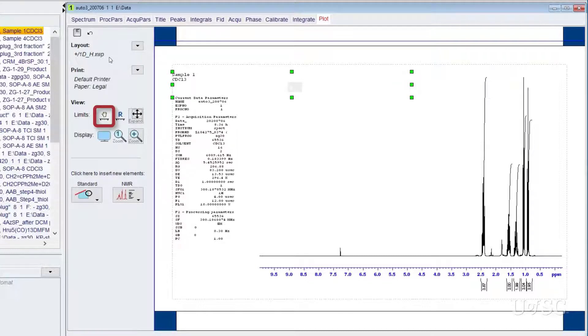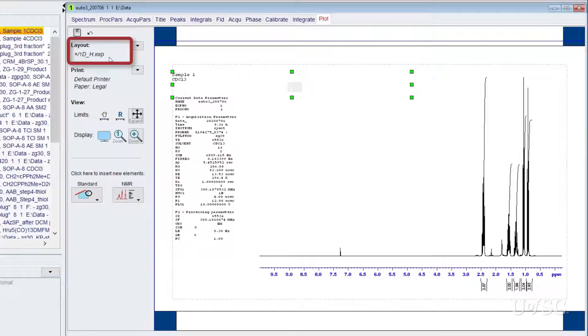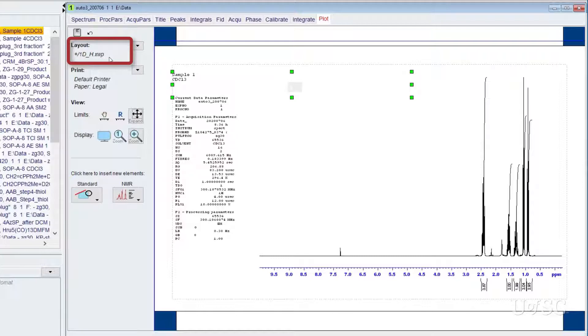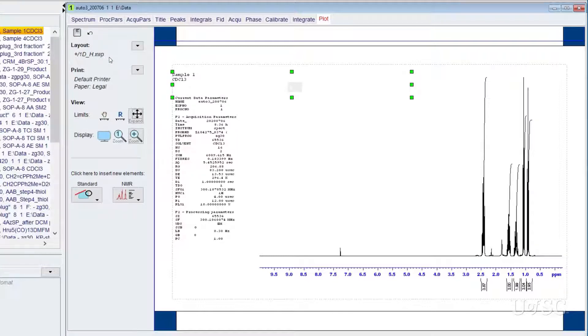The main control panel will show you the active plot layout. For proton the default is called 1d_h with the file extension of .xwp. The 1d_h layout will include the integration curves and values under the spectrum but will not include the peak labels. This is because proton spectra could have many peaks and therefore can give a very crowded plot. We have layout choices for other options.